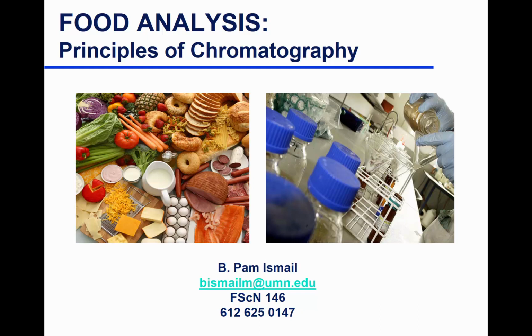So chromatography is a method of separation. In simple terms, we're separating components that are present in a mixture. The separation is often for quantification of a particular unknown, or sometimes detection of the presence of an unknown, whether it's there or not, like contaminants of concern. Sometimes you want to purify, so you run chromatography to get a component in a concentrated form. So it is basically separation of a mixture of components.